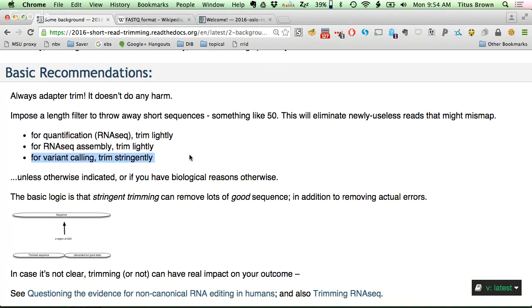But if all you want is 900 out of 1,000 variants that are in a particular genomic region, it doesn't matter how much you trim. You're looking more for sensitivity because you're going to identify the region based on many different variants all being in that region. And so you don't need to trim. I don't know if that makes sense, but basically there's biology behind all of this, right? And that's always the problem, is where do you make those decisions?